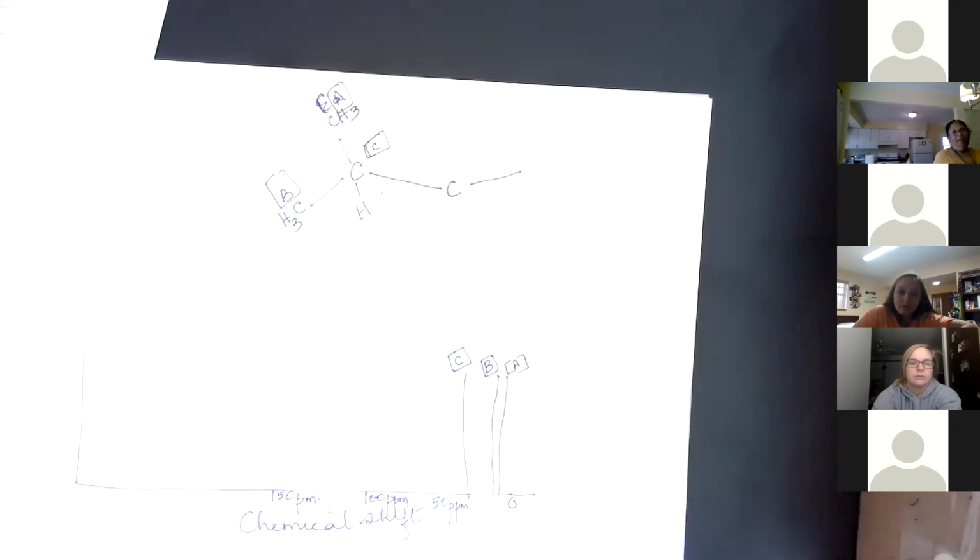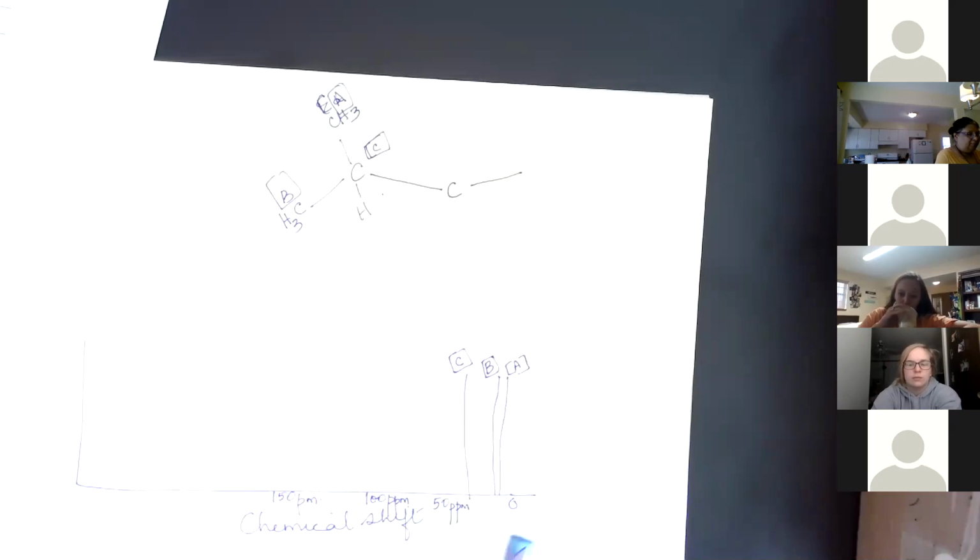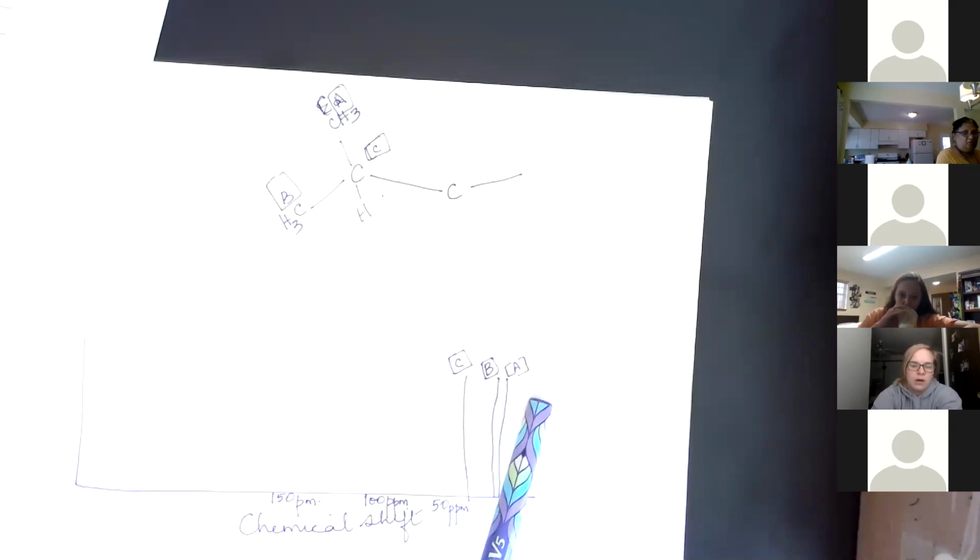Okay. And you don't have to necessarily know whether this should go before or after. We're not worried about that. We're just making it simple. You should find it in that range. All right. So that's what I meant. So when I look at your spectrum, I'll know that you placed this in the correct range, and that you put these two together close to each other, and then you put the other one, which is also in that range, a little farther away because it's different from the other two groups. Okay. All right. I know it's not the best.